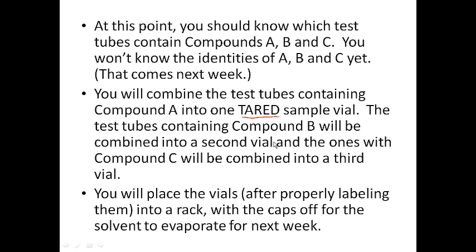So you're just going to place those vials, after you've properly labeled them, into a rack, and we're going to take the caps off and let the solvent simply evaporate over the next week, so that hopefully the following week we'll get just our solid materials, A, B, and C.